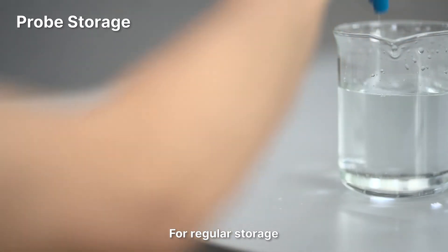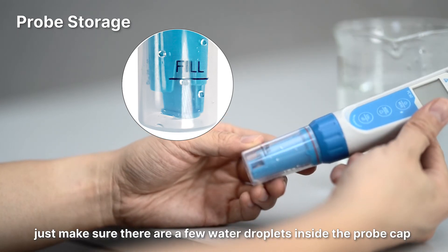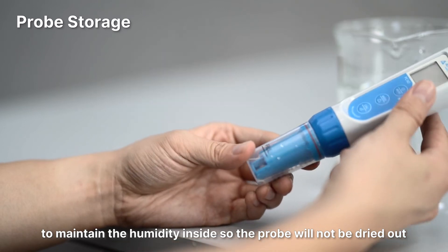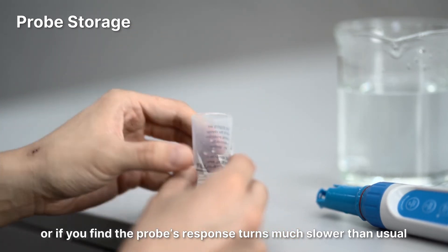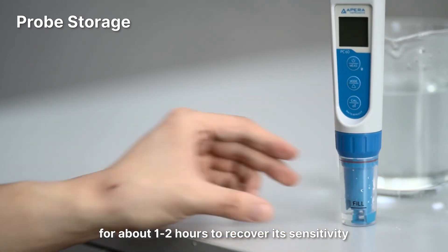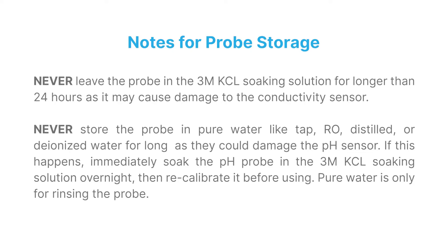Probe storage: For regular storage, make sure there are a few water droplets inside the probe cap. Close on the probe cap tightly to maintain humidity inside so the probe will not dry out. If the probe is dried out by accident or its response turns much slower than usual, soak the probe in 3M KCL soaking solution for about 1-2 hours to recover its sensitivity. Never leave the probe in the 3M KCL soaking solution for longer than 24 hours, as it may cause damage to the conductivity sensor.